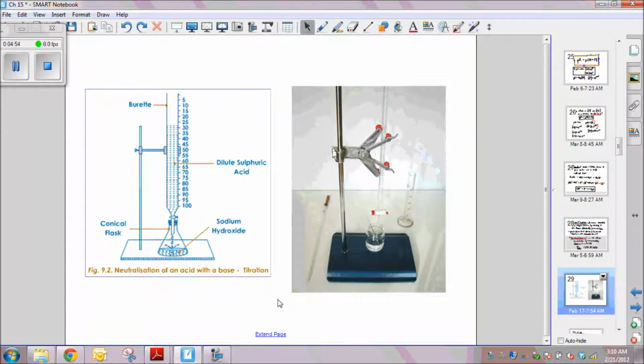It's called a burette. And a burette, I think there's one there in the classroom that you can inspect, but a burette is calibrated to the tenths of a milliliter very carefully, and therefore we can estimate to the 100ths of a milliliter in between those calibration lines.